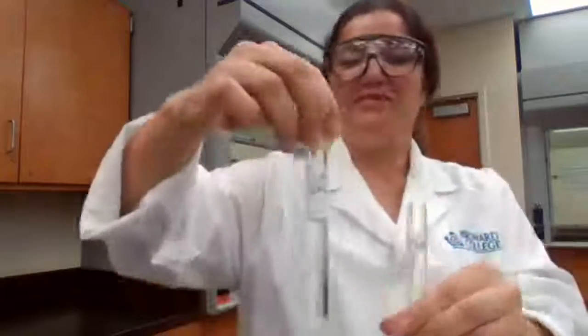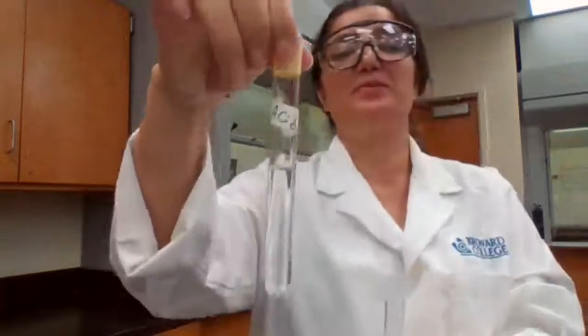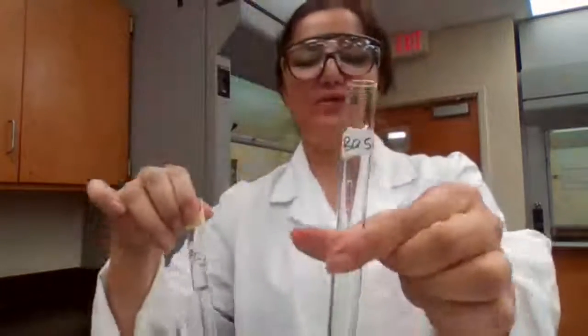Today I performed 3 experiments. I'm a little slow because I'm a little exhausted. Anyway, I have my test tube labeled acid and a test tube labeled base.